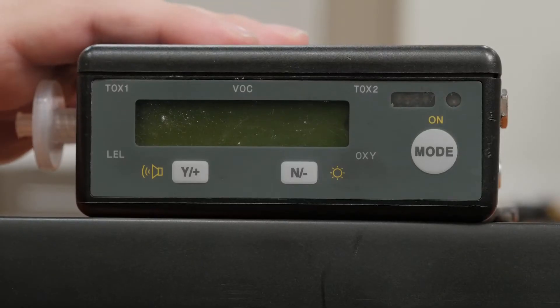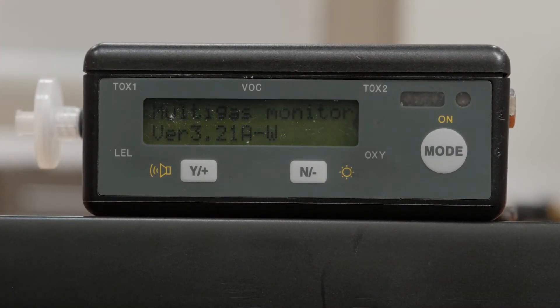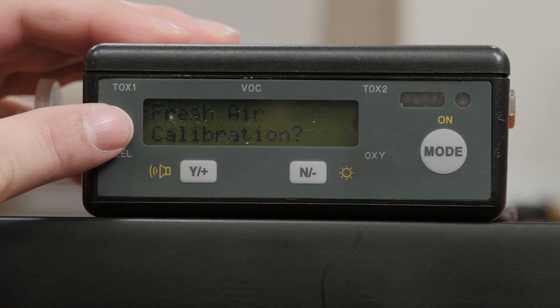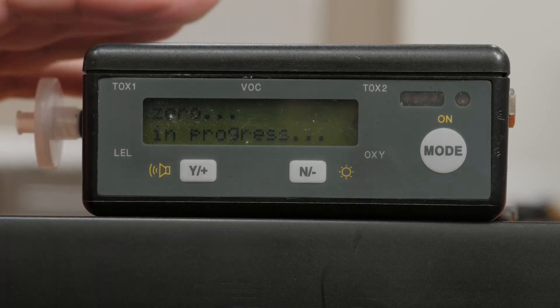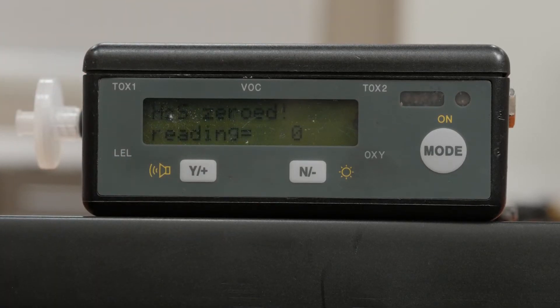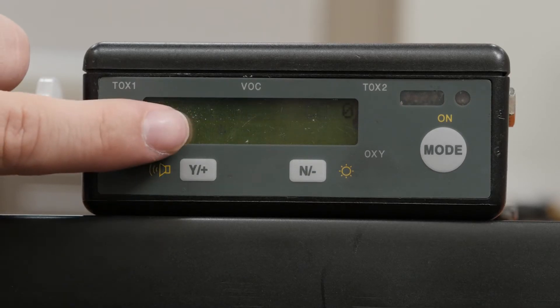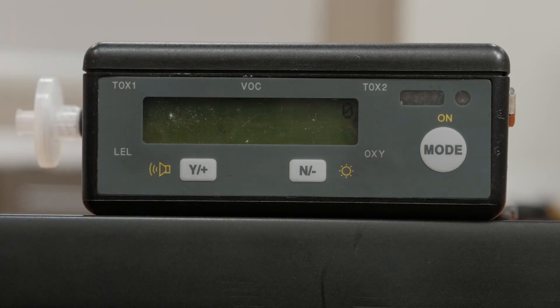Next, start the carbon monoxide monitor by pressing the mode button and releasing it when the display turns on. The instrument will go through a series of self-tests and the screen will hold on fresh air calibration — this may take several minutes. Press the Y button to start the fresh air calibration. Once complete, the unit will automatically begin logging and concentrations will be displayed. There will be a flashing L on the display, indicating that the unit is data logging.